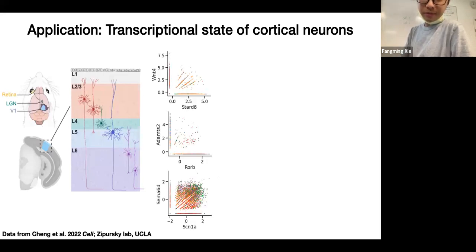Questions? Here's an example, gene expression data from the mouse brain. You can evaluate any 2 genes and plot them, where each point is 1 cell. Then you see some structure, but it differs for every combination of genes you picked. These are 2 different genes, these are 2 different genes, these are 2 different genes, and you see different patterns. But the question is, what are the overall patterns among the cells that we measured?